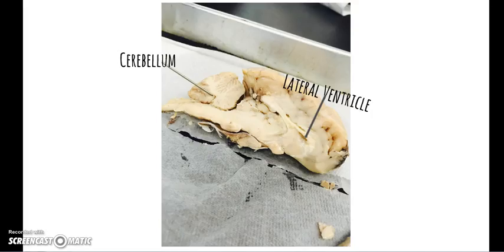Here we have the cerebellum and lateral ventricle. The cerebellum controls muscle coordination and balance. The lateral ventricle controls cerebrospinal fluid.